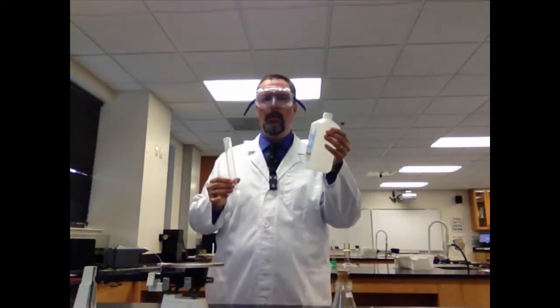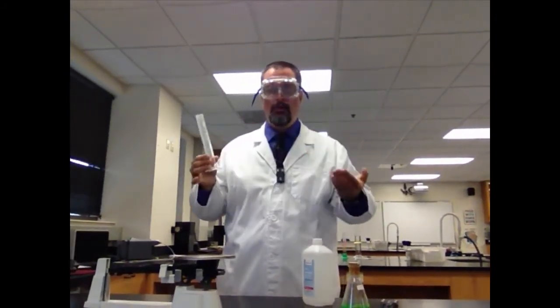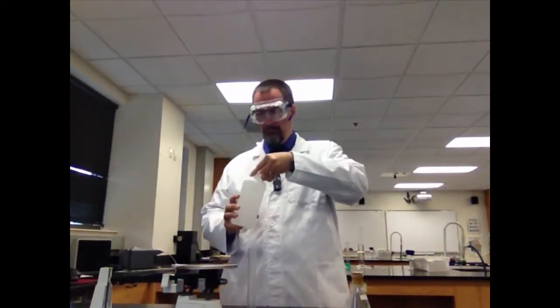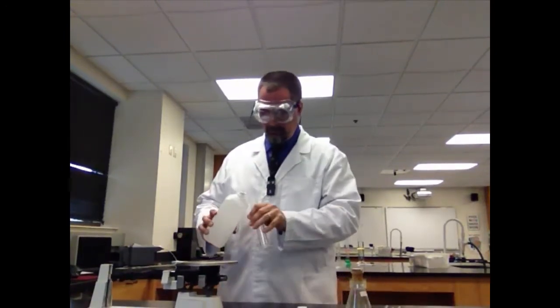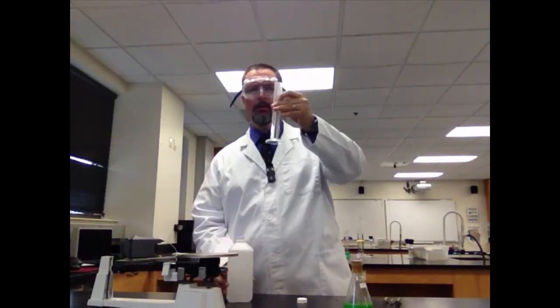So now you have the mass of this thing empty. The next thing is you're going to pour a certain amount of the liquid into this graduated cylinder. And it doesn't matter how much you pour in. You just have to know the volume of it. That's your volume for your density. And when you pour a little bit in, again, it doesn't matter how much.